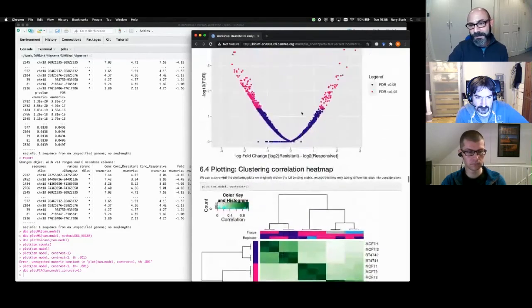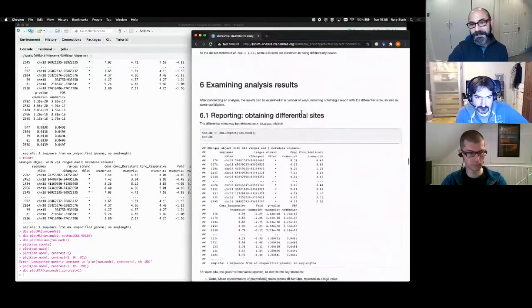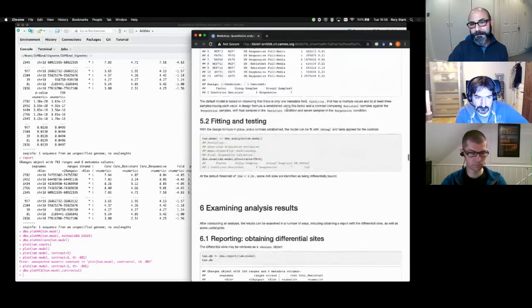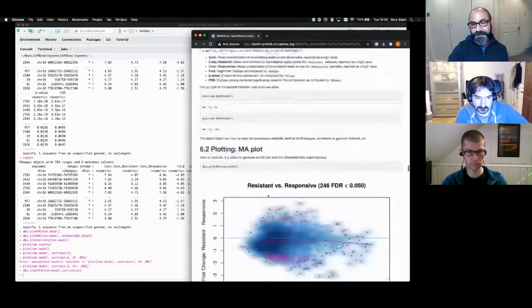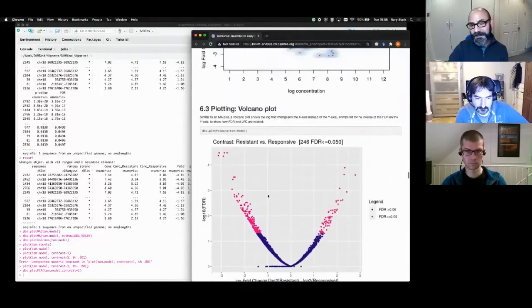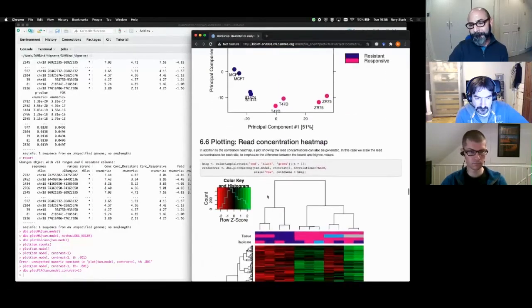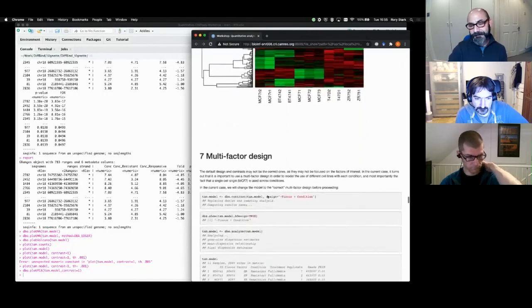So in this one, I want to show you the model is, there it is. The model's just condition. So it does show you that once you start getting into multi-factor models, you have to look at your data a little bit differently. We can also get a traditional heat map of the concentrations to show where things are gained and lost.